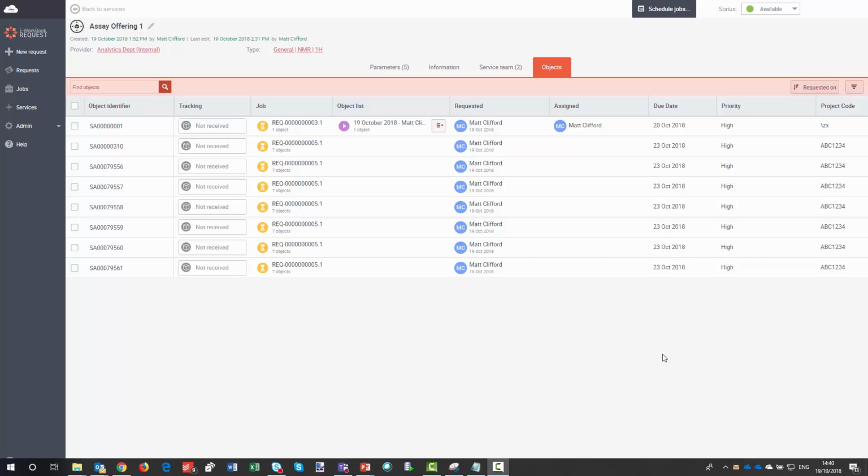In this video, we're going to show you how you can select samples to an object list and import that object list into the spreadsheet, bringing all the metadata about the work along with it in a couple of clicks. So let's begin.